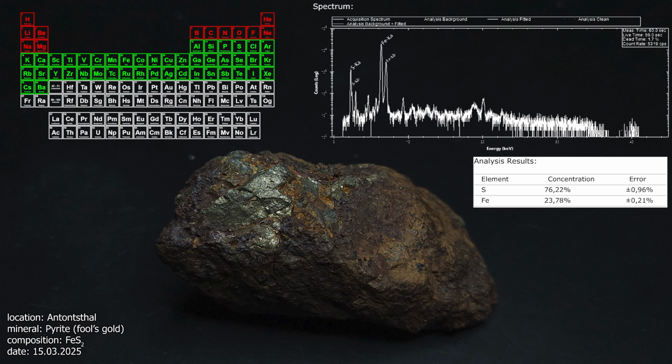This means that we can look much deeper into the sample with the iron XRF lines, as higher energy radiation passes through more of the sample itself. In this case it fits very well, but I would rather be cautious. The device cannot have an appropriate correction factor for every energy of every material.